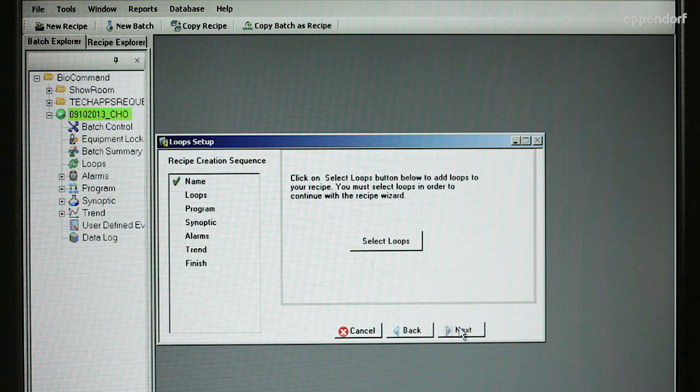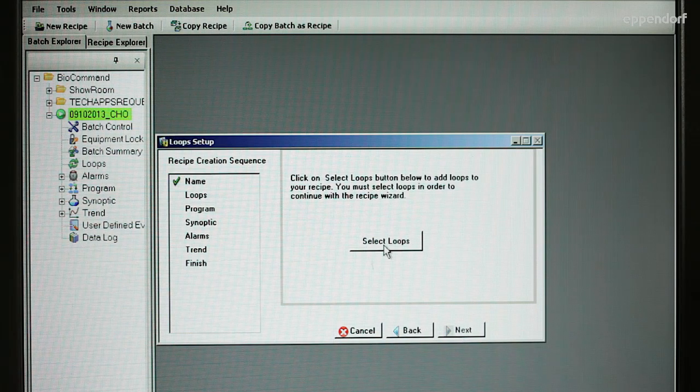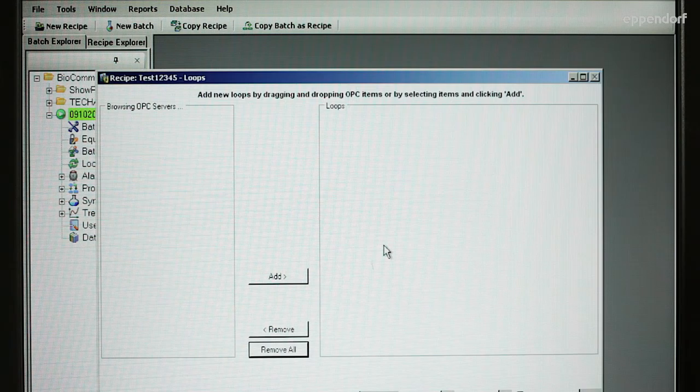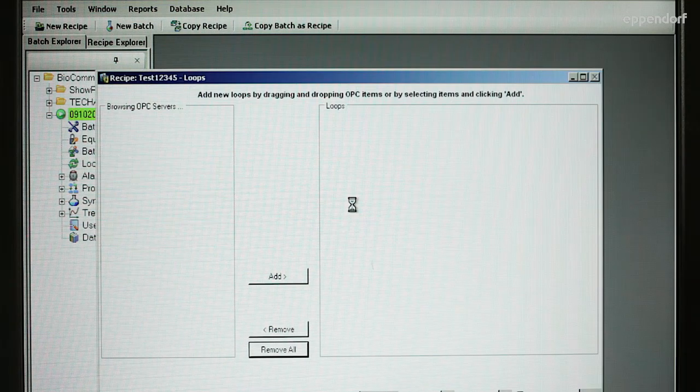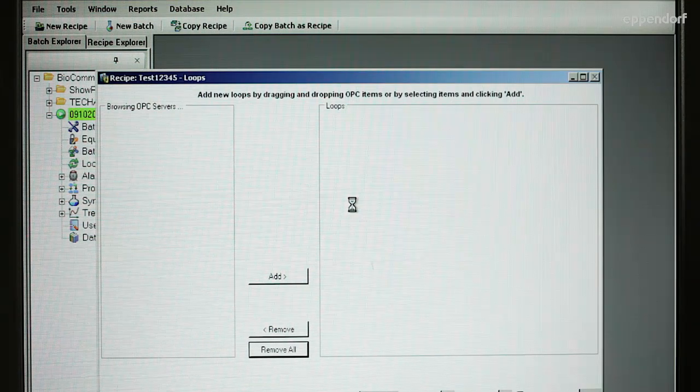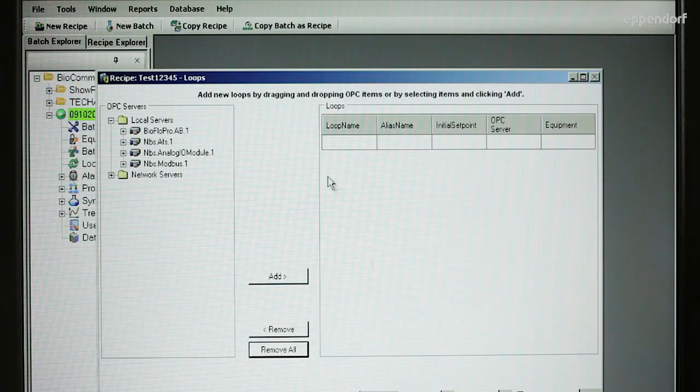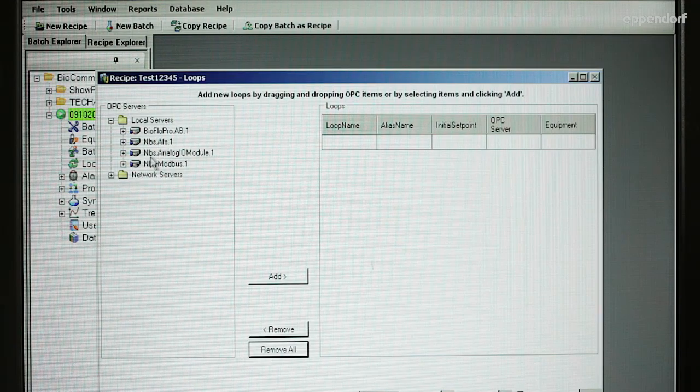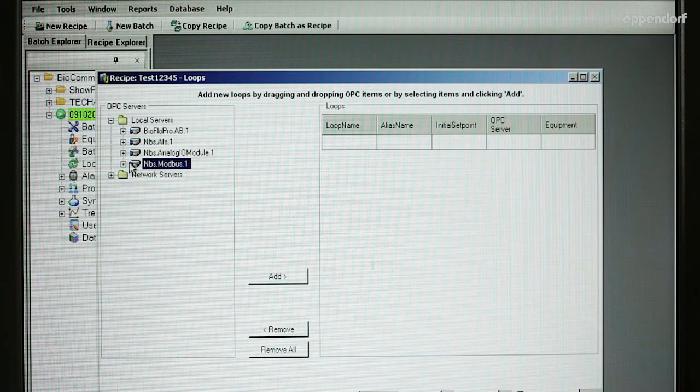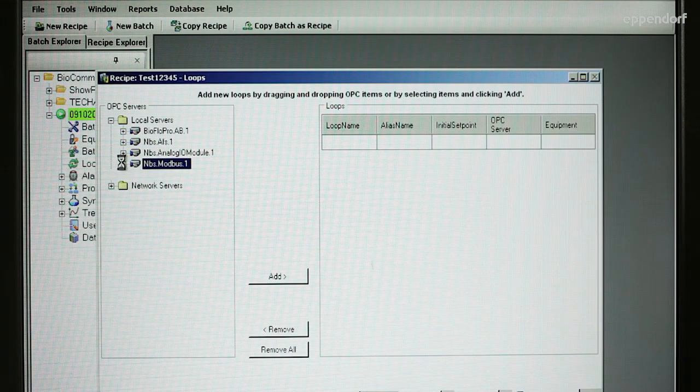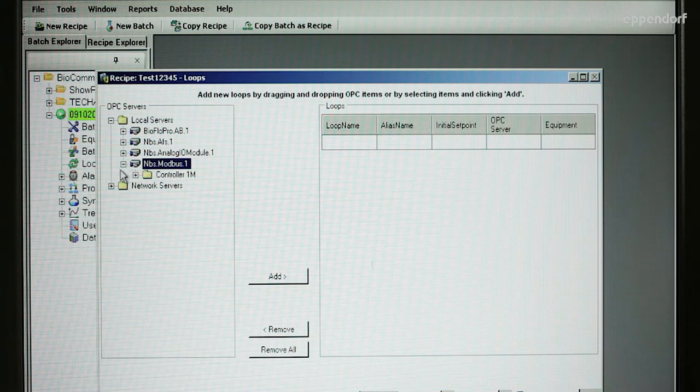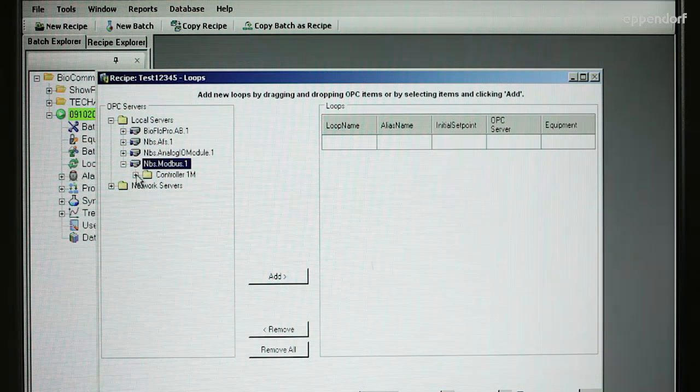Click Next to go to the next screen and then click on Select Loops. In the left-hand panel, the OPC servers that are available for this system are displayed. Click on the plus sign next to the one that corresponds to the COM protocol you will be using.